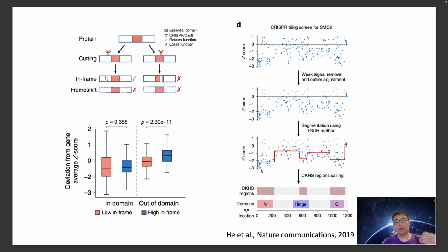noise within the signals, and it can get important patterns within the noisy data. Okay, and through this we can find these three fragments of this protein. Actually these three regions correspond to three important domains: the N-terminal domain, the C-terminal domain, and the middle hinge domain. Okay, and these three domains are working together to make this protein function well.